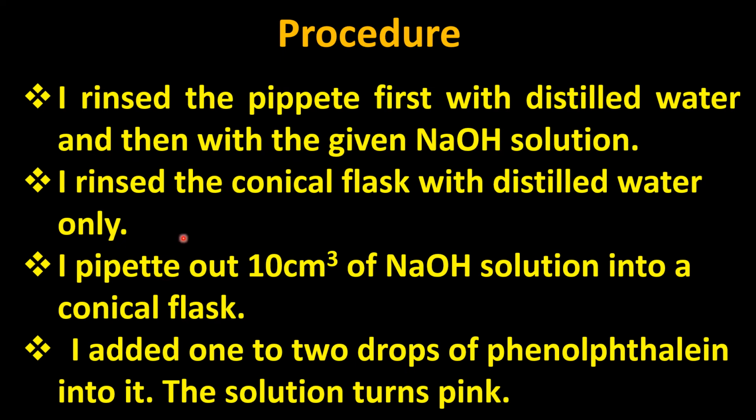Then what I have to do? I have to pipette out, with the help of the pipette by sucking, 10 cm cube of sodium hydroxide solution into the conical flask. Now what have I taken in the conical flask? I have taken 10 cm cube of sodium hydroxide solution. And please remember that sodium hydroxide solution is a solution whose molarity is unknown.